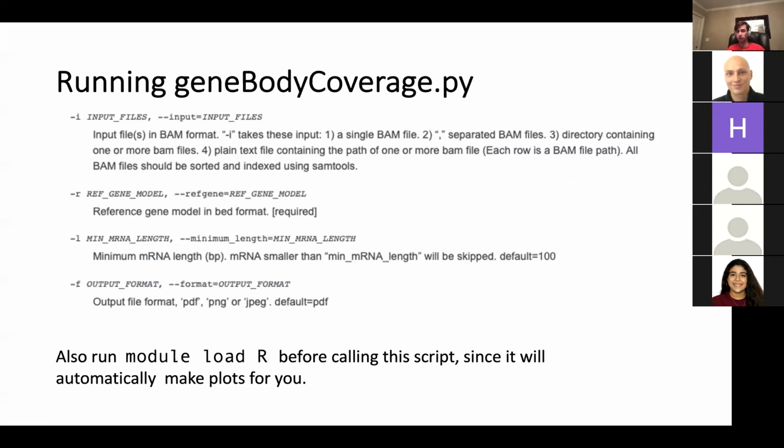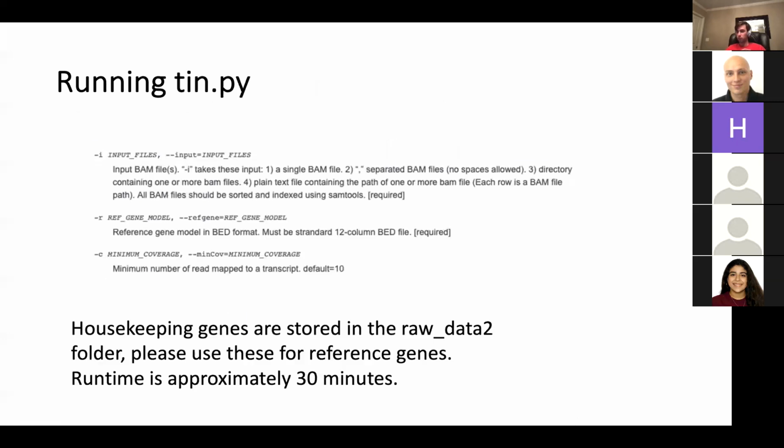Okay, and the plot for the tin scores, we have to make that ourselves, right? Yeah, so there's nothing in particular we want. Maybe a table, maybe a bar plot. Okay. And maybe say a tin score can be used to measure sample quality, and then we did that for each sample. I guess include a few English sentences instead of just code and figures. Okay, thank you.